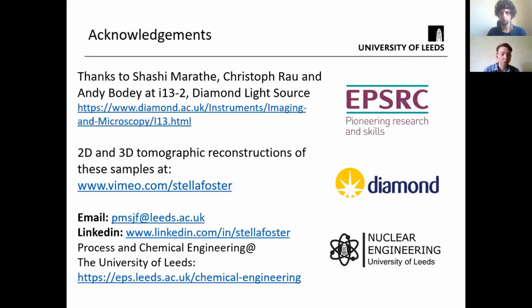Thank you. Sure, absolutely. It was pre-treated with zinc chloride mixed in a 1-to-1 mass ratio, dried, pyrolyzed as with the control sample, and then the biochar sample was washed in, I think, 1 molar HCl, and then water to remove any residual zinc. Does that answer your question?